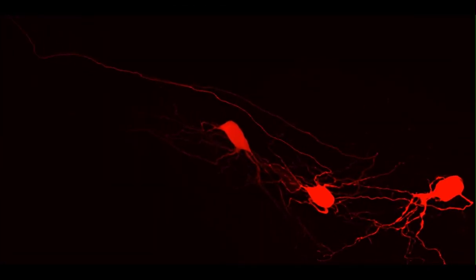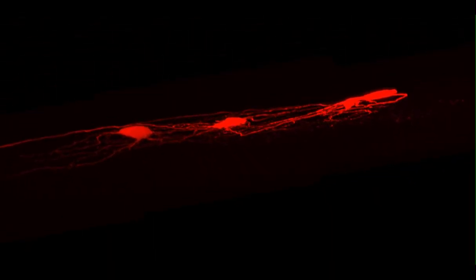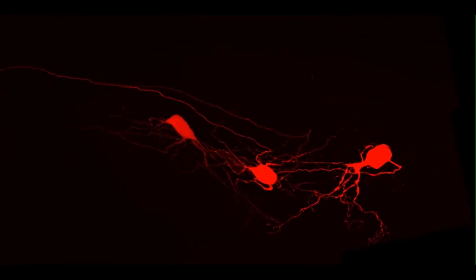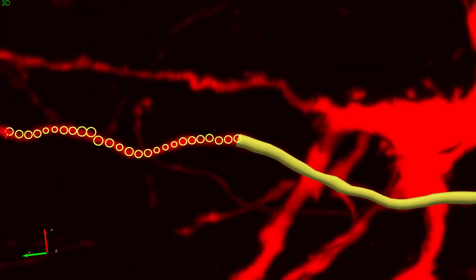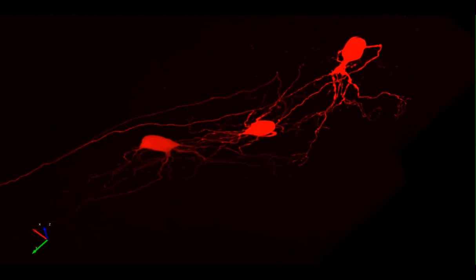Their lab has backfilled cells with the stellate ganglion and recorded electrophysiology data for that cell. Next, they imaged the cells using an epifluorescence microscope at 40x to easily distinguish the neuronal pathways. They segmented the neuronal structures in the high-resolution image using Neurolucida 360's semi-automatic tracing mode until all relevant structures in the image were represented.